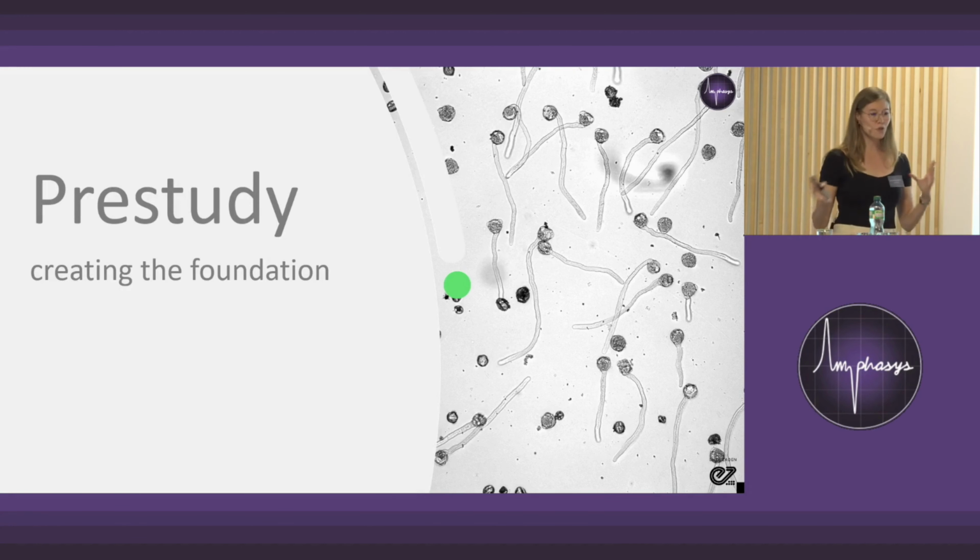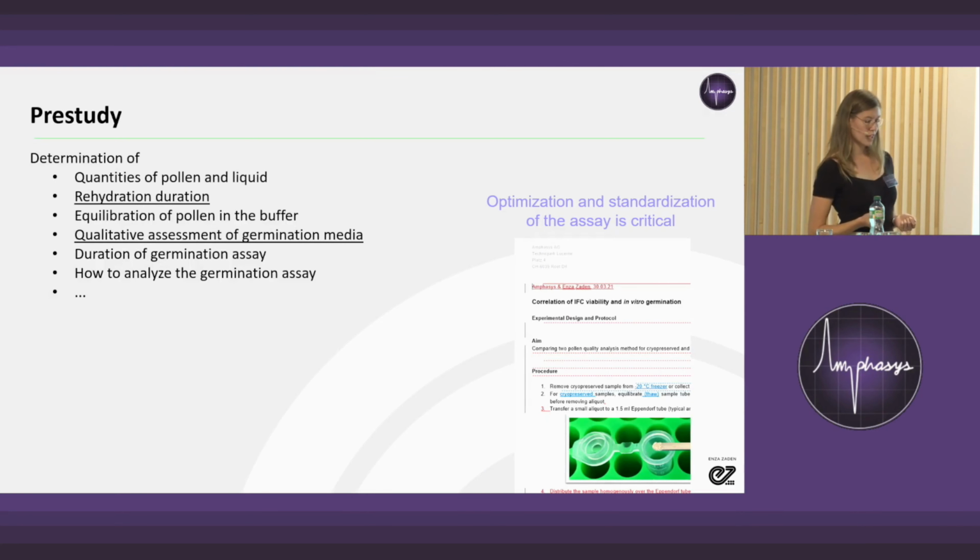So, well, before really getting started, we first did a pre-study to create the foundation. Since we were going to perform these assays at 2 totally different locations, we really had to standardize our protocol. So these are some of the aspects that we checked in our pre-study. As mentioned, it was really optimization and standardization of the assay. Some things I want to highlight is the rehydration duration, as well as the assessment of the germination media.